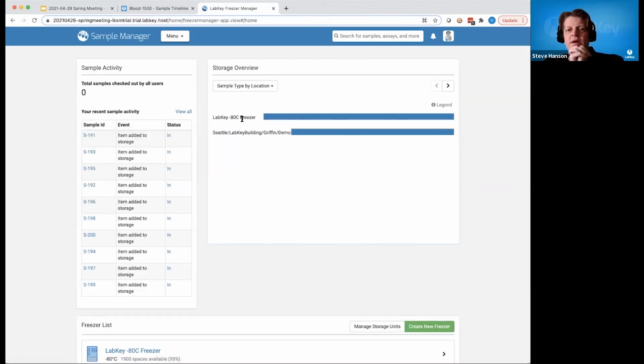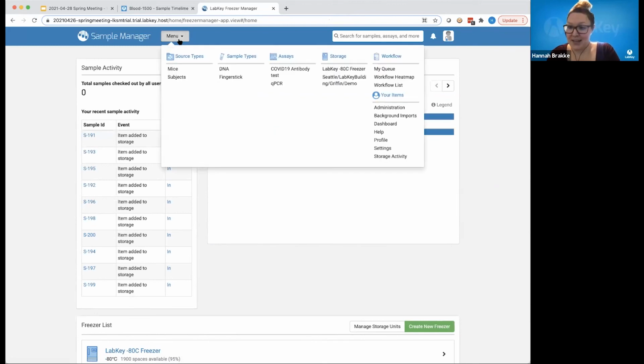Great. Another question. Does Sample Manager support chemical plant quality inspection lab testing? We might have hundreds of assays and the menu may not fit them. Yeah, so not being familiar with those assay types, my general answer is that we are science agnostic. So if what you saw today in creating your own assays worked for you, I think that's certainly possible.